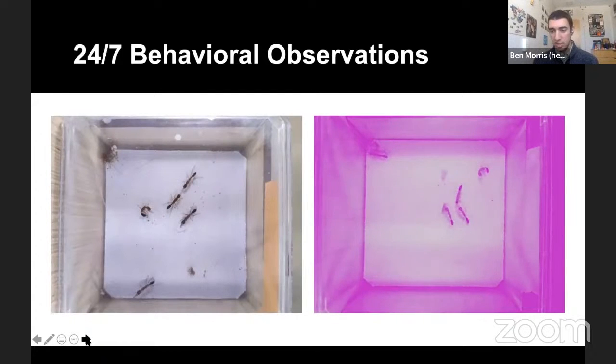And at night, even if it's a little washed out in the red light, we can still see the legs of the ants, and the movement of the antenna, and their feeding or sleeping or whatever they're doing at night. We can still visualize that without having to go into lab or disturb the ants.